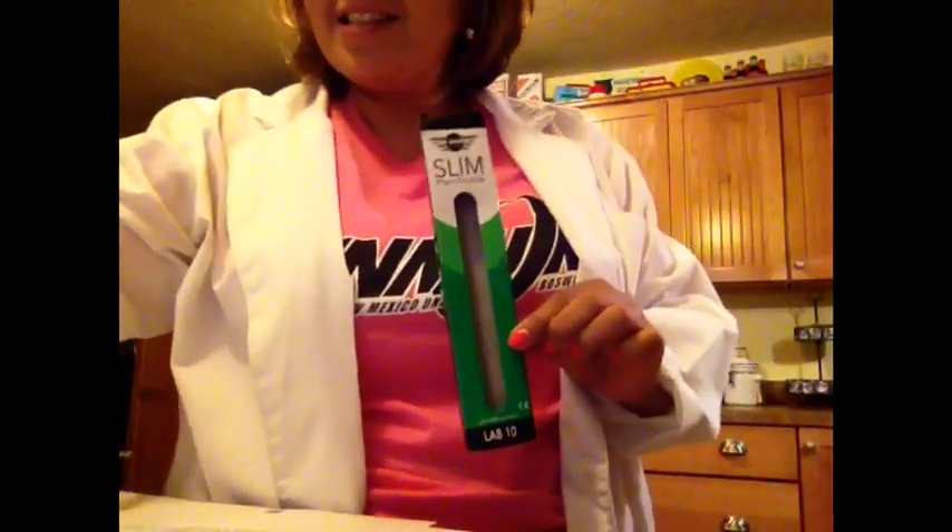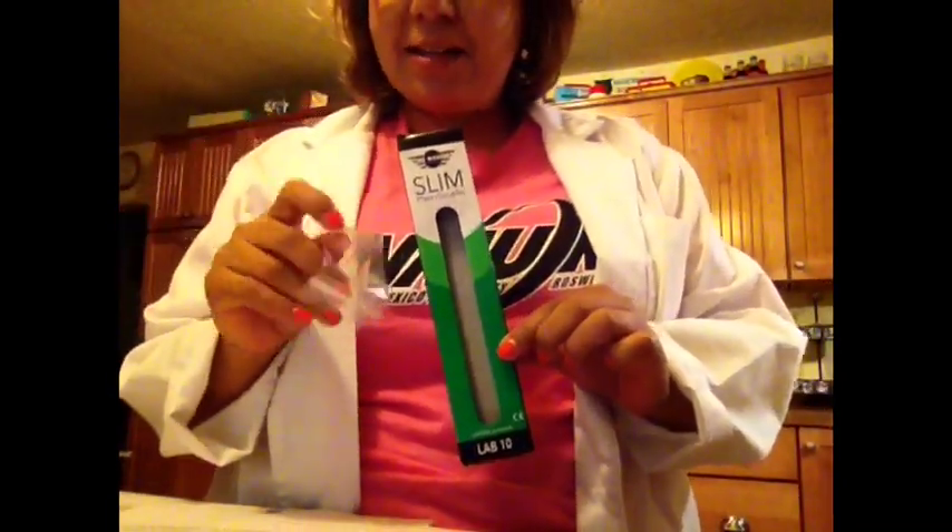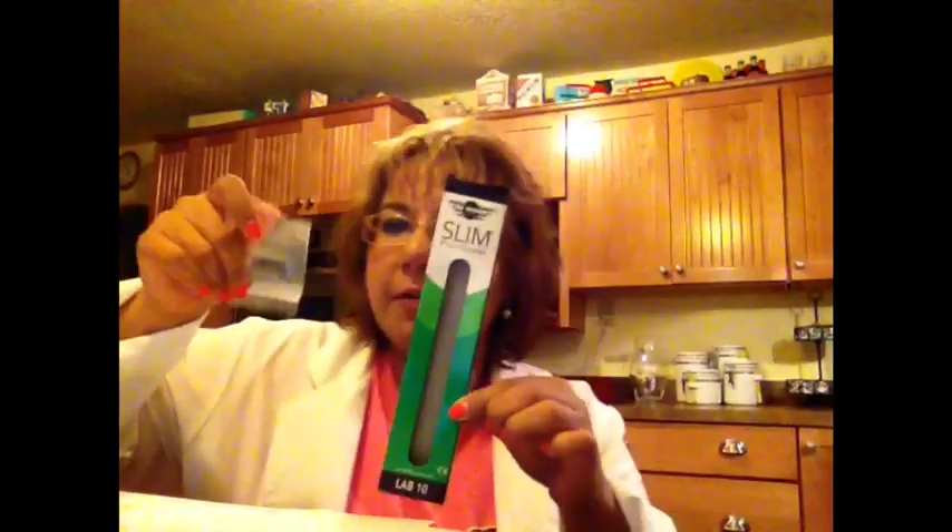If you opened your pen scale, inside there were a couple of little plastic bags — little empty plastic bags. Don't get rid of those. We're going to use them as part of today's procedure.